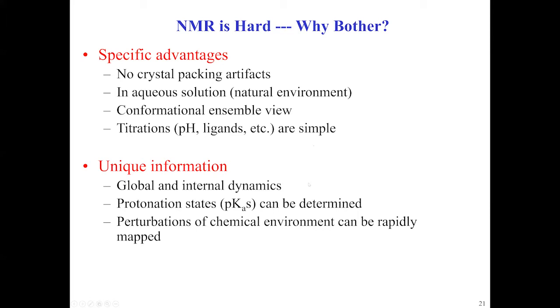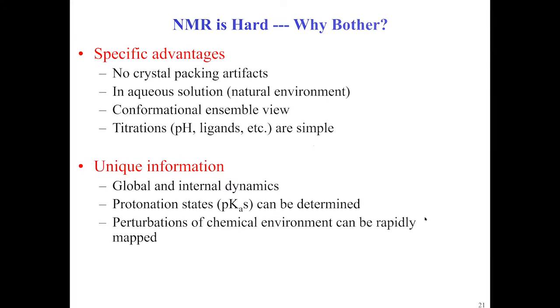And of course, this is not just for bioworld, for sure it will be for any diffusive process in the battery or a CO2 fixation, it will work the same way. Protonation state, this is a big thing when you do biomolecules, chemical shift environment, and this we will come to when two molecules interact or a molecule will take different shape. I a little bit showed you conformation exchange. This will be the way to map them, to know where they occur and how to get insight.